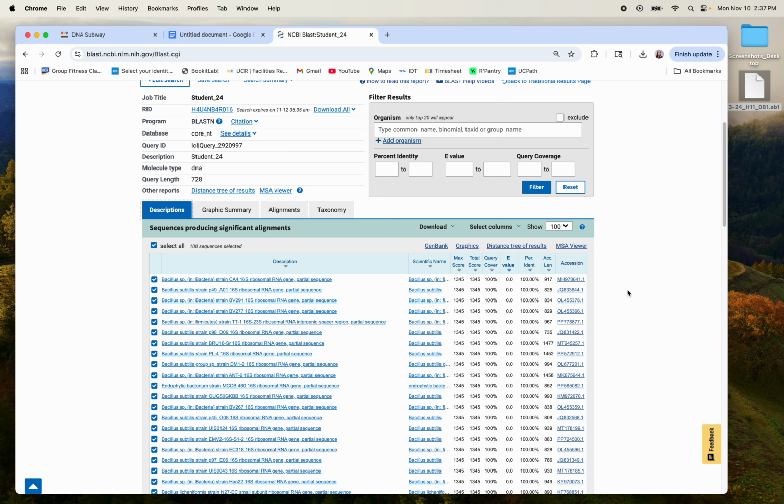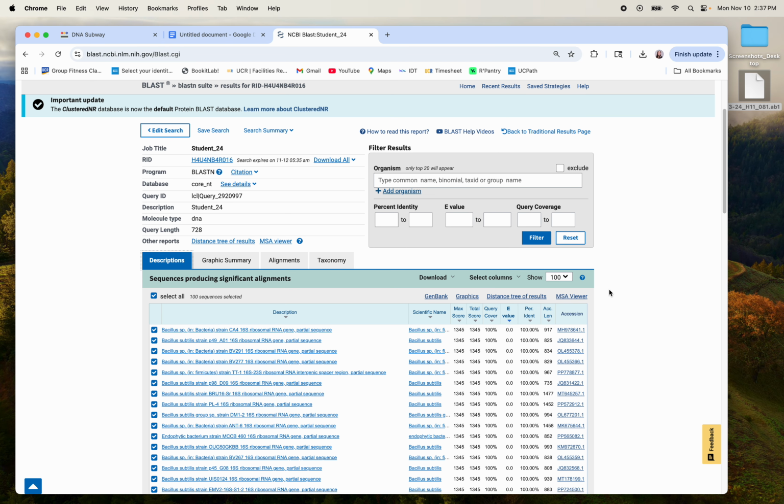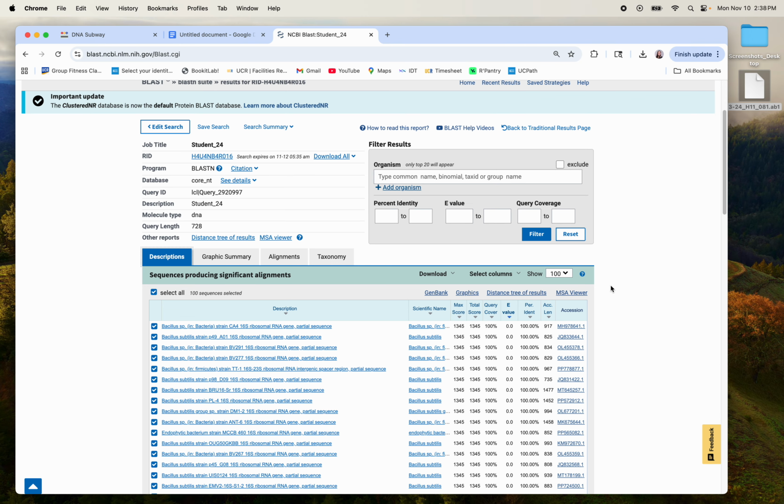Okay, so you are going to need to include this in your lab report, and we want you to record all of these values in your lab report, just to make sure that you understand how to do this process and see what exactly your bacteria might be. So if you guys have any questions, feel free to talk to any of your TAs and or just bring it up during class next time we meet.